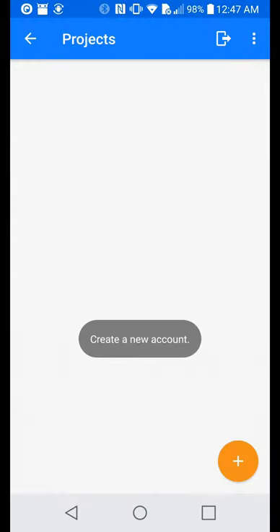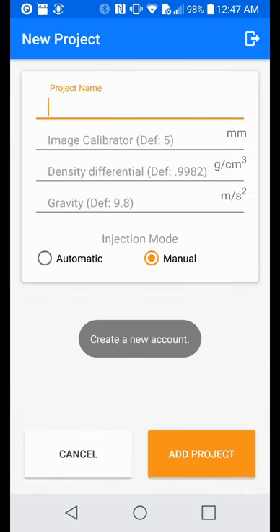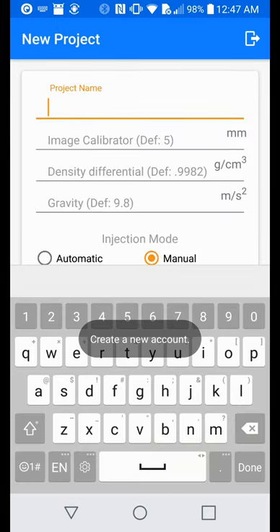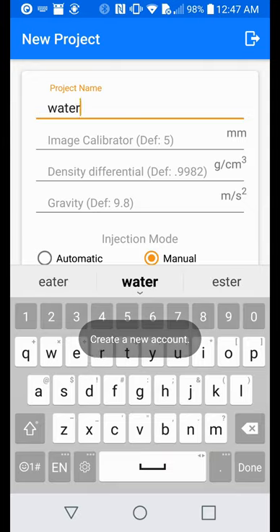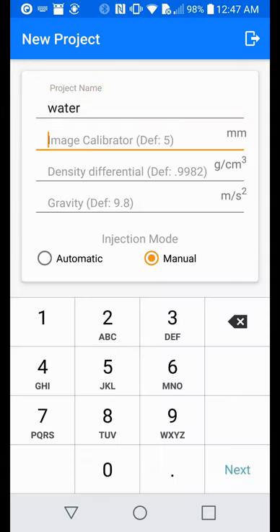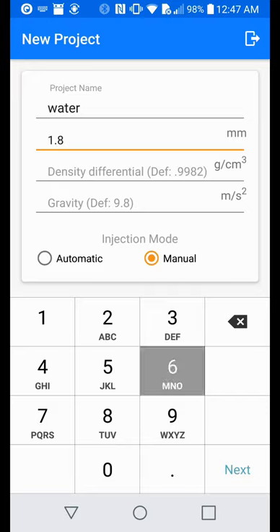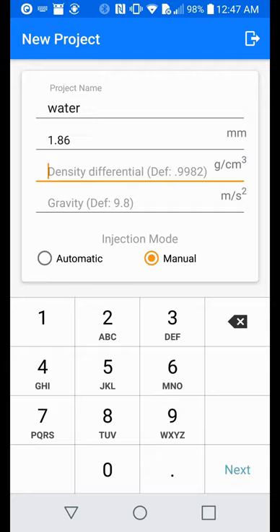After signing in, we must create a new project. This includes the project name, the image calibration number, which is the outside diameter of the needle used in the experiment, the differential density, which is the difference between the density of the liquid and its working environment.